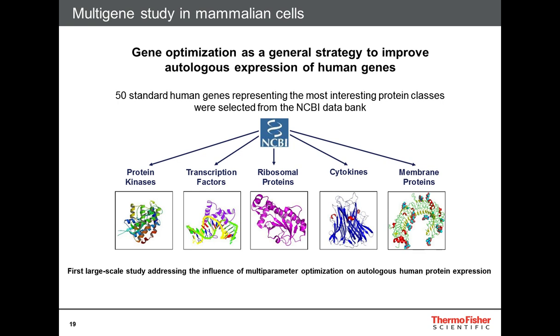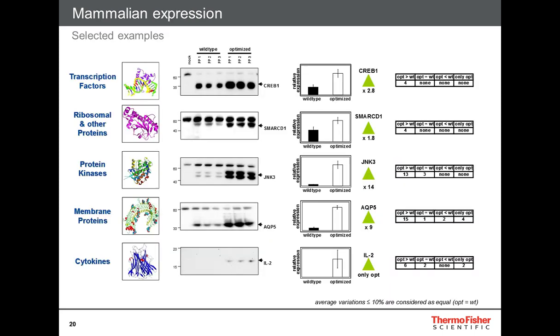Of course, our genes in our body are not optimized for highest yield, but they are optimized for highest performance in the overall context of the cell. So maximum expression is of course almost never a goal of the evolution and the design of our genes.